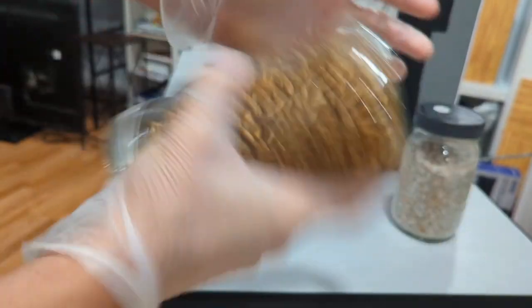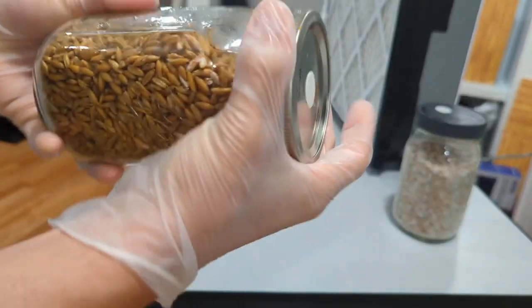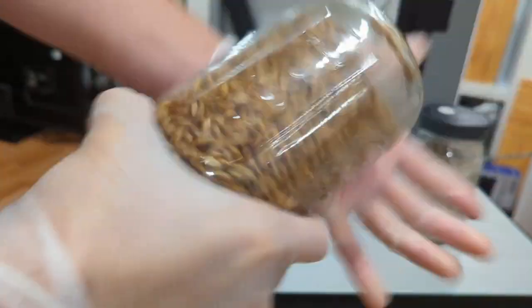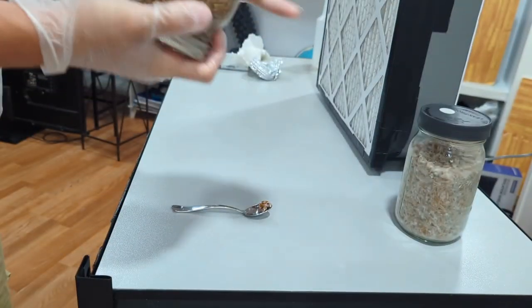Go ahead and mix in those grains that you put in there into the uncolonized grain. You can be gentle, but just give it a little shake, a little mix around — whatever will do fine.